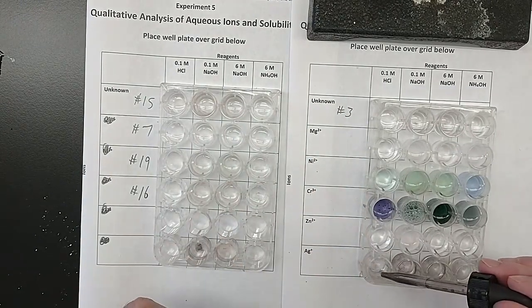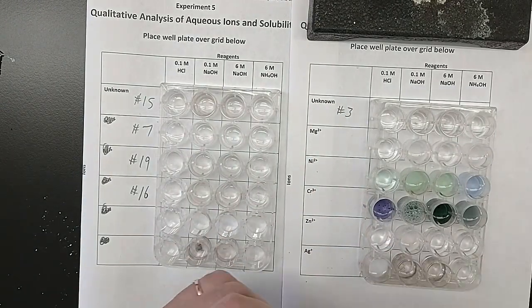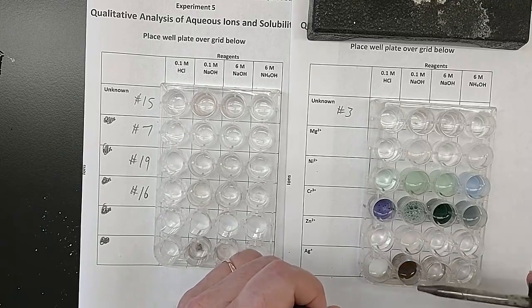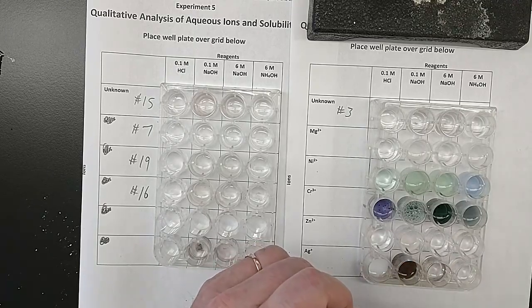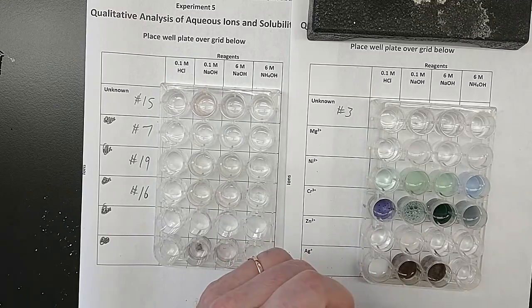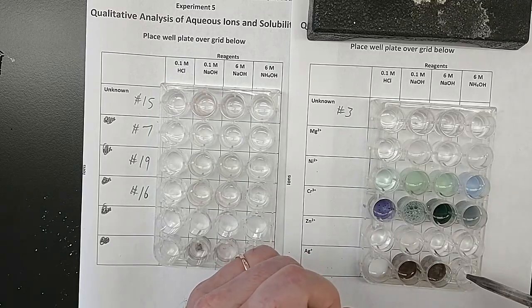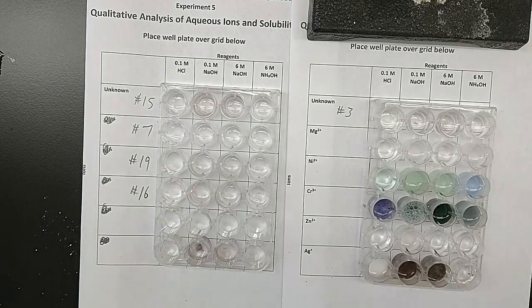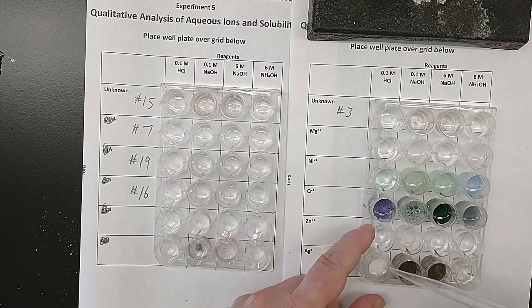And when I add 10 drops or so into the HCl, into the NaOH, into the more concentrated NaOH, and into the ammonium hydroxide, we stir each one.